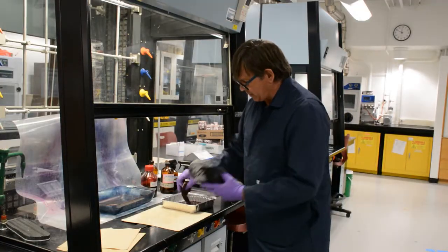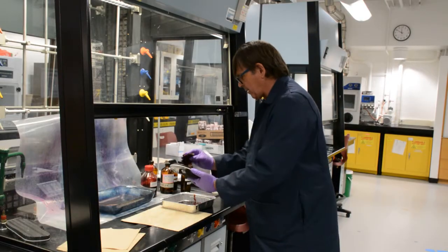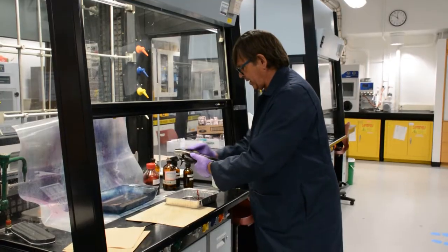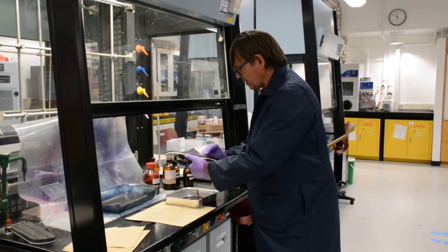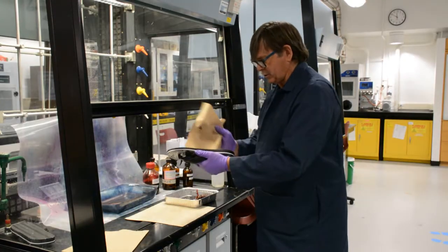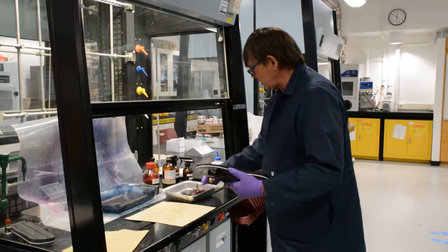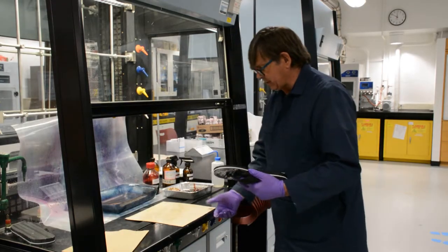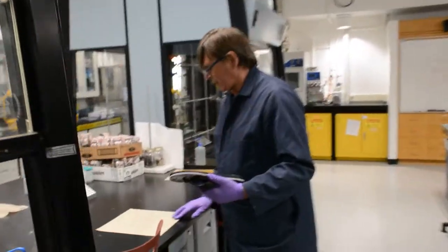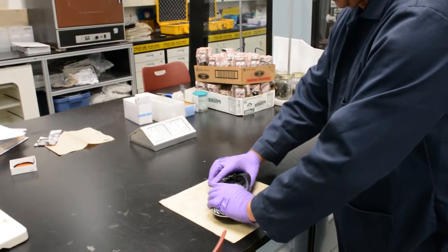So instead, we're going to take this blood deposit on a paper towel and just wipe the outsole surface, the tread area of the sandal. I'm just going to take off some of the excess. I don't think we need quite that much on. So from this stage, I'm going to take this clean piece of vinyl tiling and put it onto a harder surface here that's more conducive to getting a good impression.